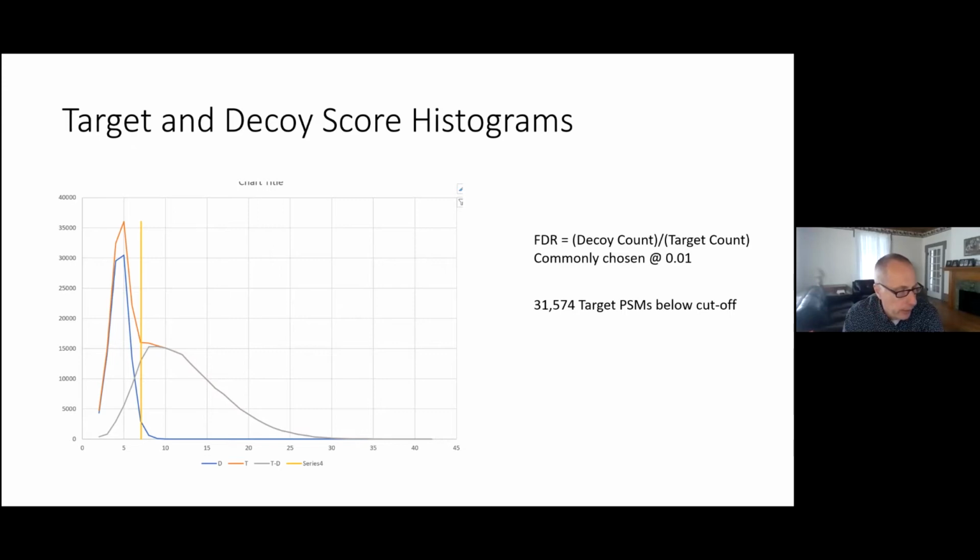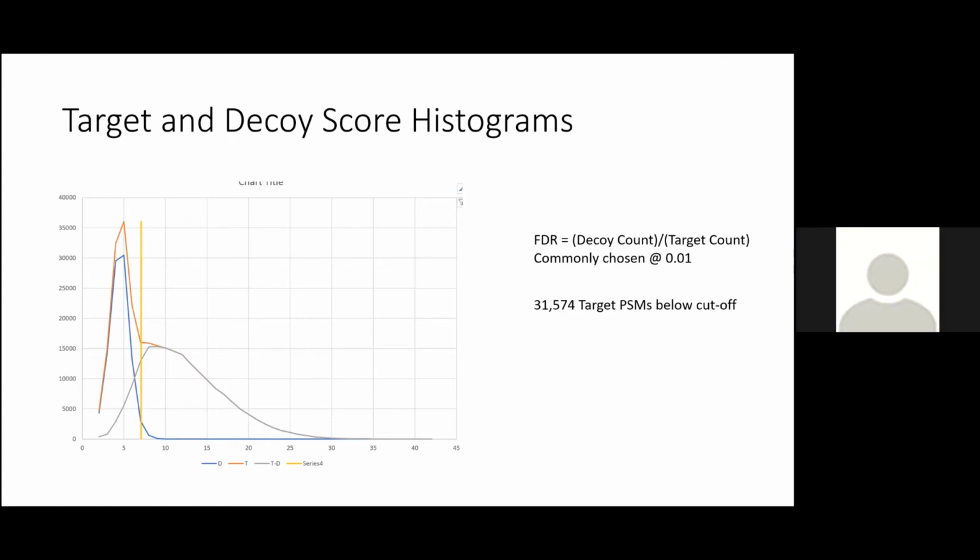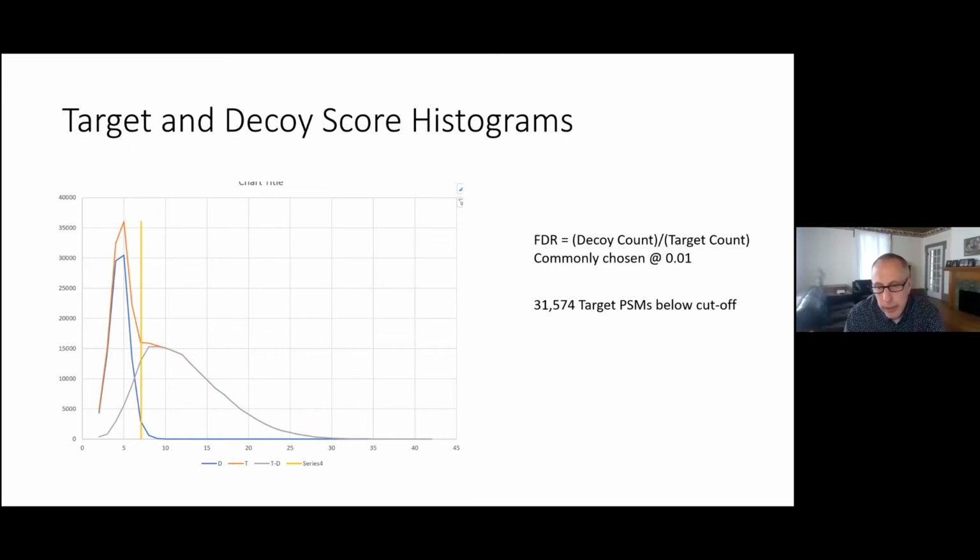Not to mention that one of our students wrote an excellent program for intensity-based quantification. Given the stochasticity, we can go back and look for peaks that weren't necessarily selected, but that we've seen in other spectra. So we can get pretty decent measures of peptide quantity by looking at the MS1 intensity or the MS1 integrated peak areas. That's in our wheelhouse to do, and at the current time that's the best quantitative measure we have of peptide abundance. So I don't really pay that much attention to lists of PSMs.